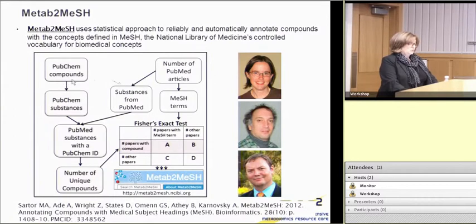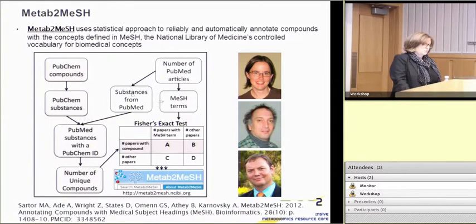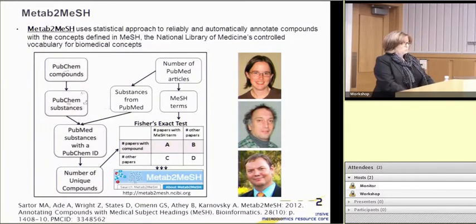It's huge, right? Then we downloaded the entire PubMed, and we do it periodically to update our tool. The National Library of Medicine basically annotates all published articles with medical subject headings, or MeSH terms. If you go to the PubMed database and look at an abstract of a publication, you can click a link there, and it will show you MeSH terms. They also generate a file of various substances that are mentioned in published literature. We merged these two data sets together to link PubChem compounds to published literature.